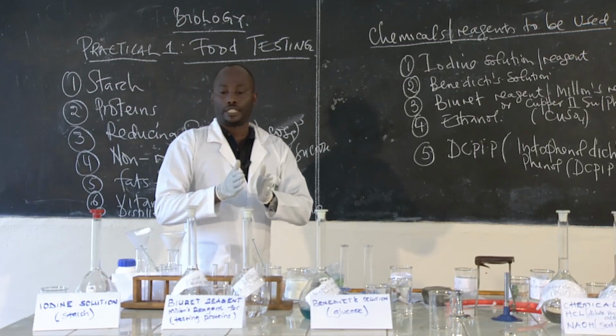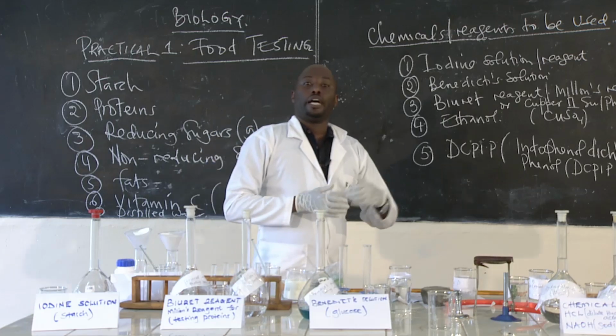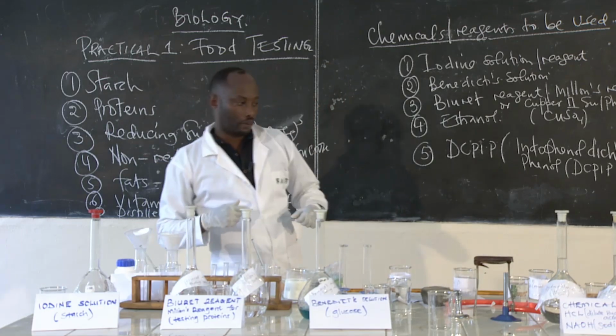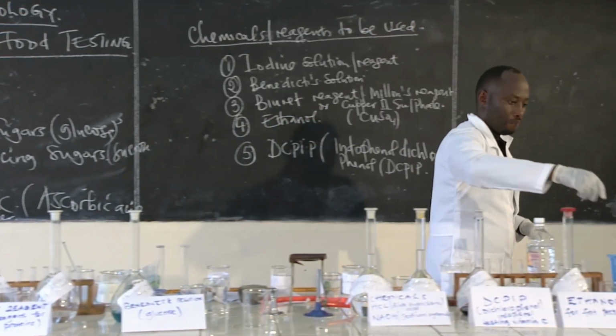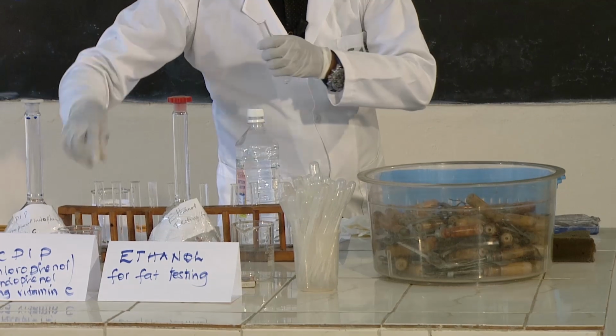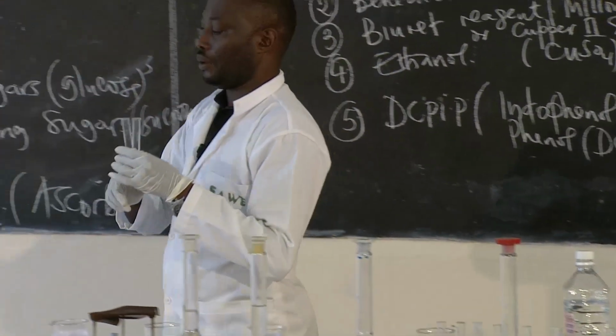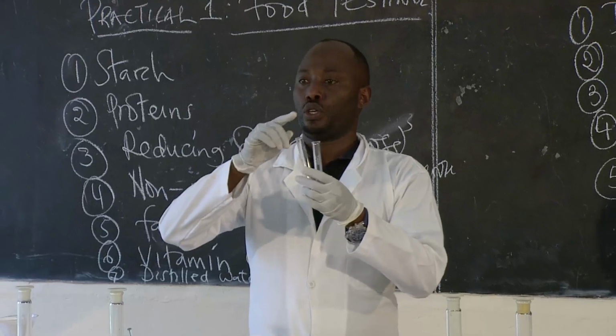What do we use in testing starch? We said for testing starch, we use the iodine solution. Let's start our practical. I will have 2 test tubes, and I will use those 2 test tubes to test starch.